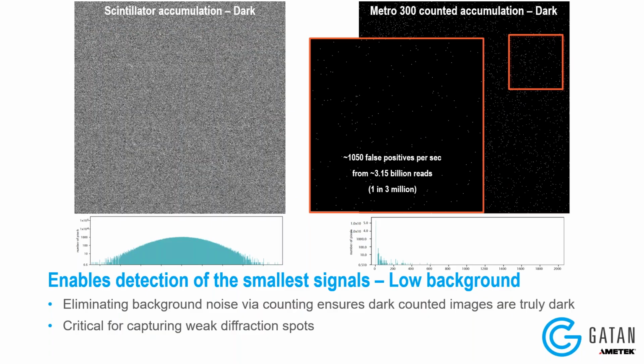So this is quite a long time of adding together any residual readout noise that we might have, or any spurious, perhaps X-rays or other events. And so we see here that in this 10-second image, we are getting only a few false electrons.